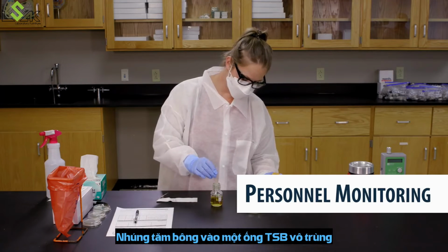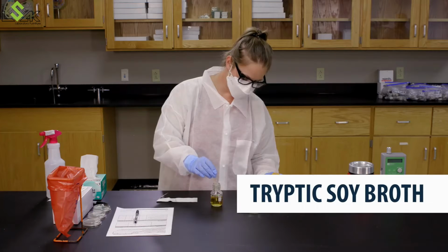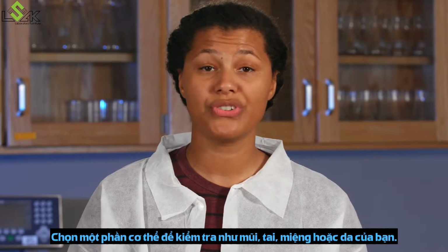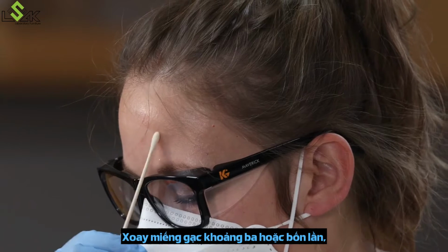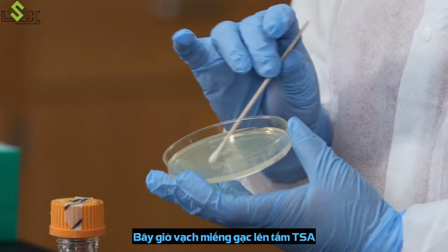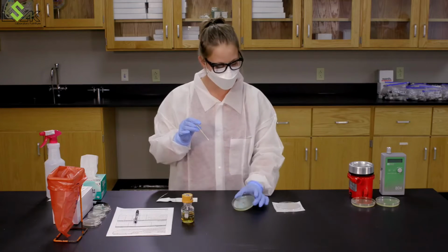Dip a cotton swab into a tube of sterile TSB, that stands for tryptic soy broth. Choose a part of your body to test, like your nose, ear, mouth, or your skin. Cassie here is going to test her forehead. Rotate the swab around 3 or 4 times, spinning it so that the entire tip comes into contact. Now streak the swab against the TSA plate in a zigzag pattern while rotating the tip.